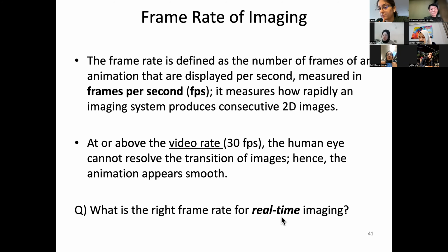For example, you may remember the action potential is about a 1 millisecond scale. To see that millisecond scale, you need at least 1,000 frames per second, which is very difficult for a typical camera. So we are trying to overcome that. I hope there will be some opportunity for me to share it with you. But that's advanced microscopy. So thanks for the question.